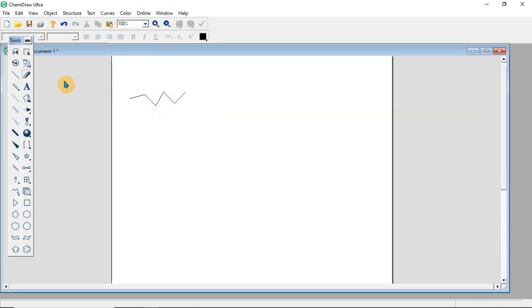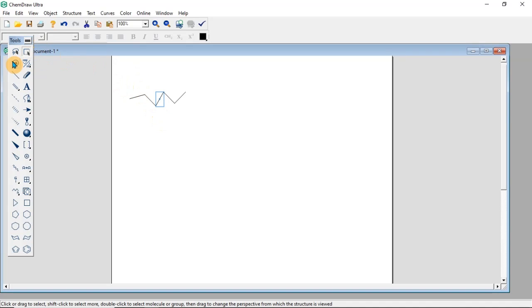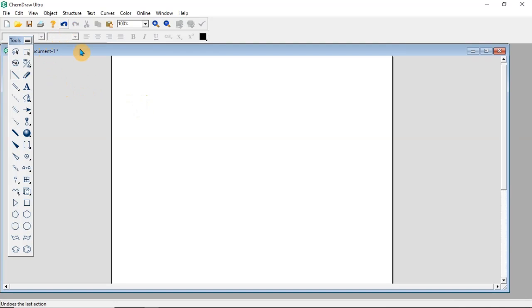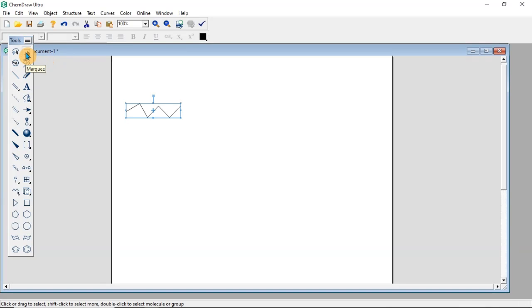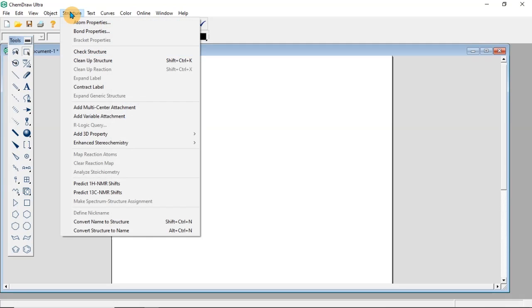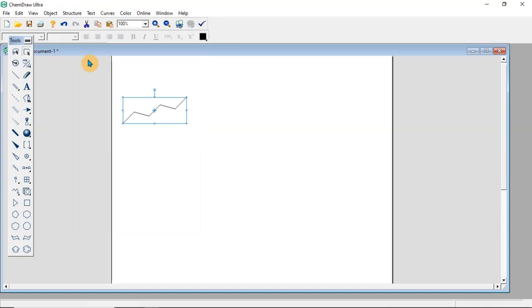If you have a rough structure and want to clean it up, click on the select tool and select the structure. Then come to Structure and click 'Clean Up Structure'. You are going to have the structure oriented in a fine form. You can also select the structure again and clean it up to attain a particular or preferred orientation for your structure.